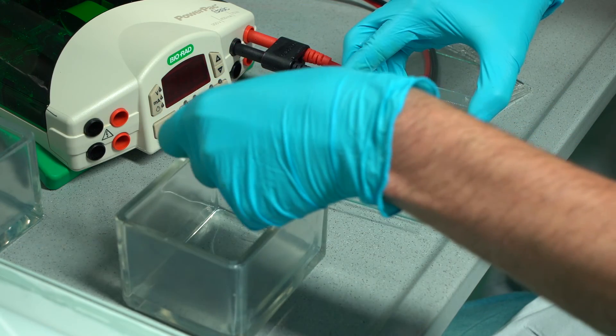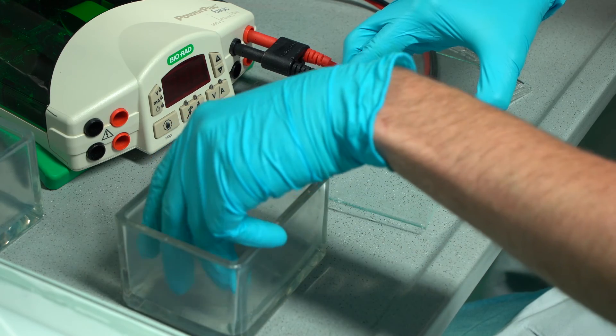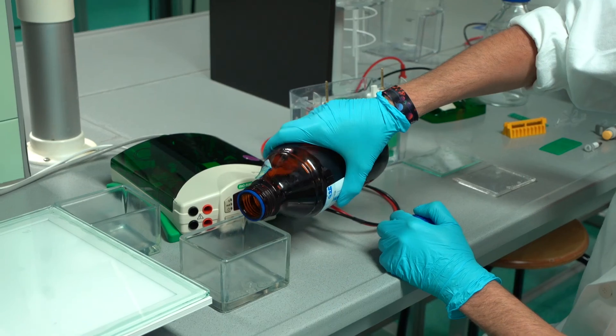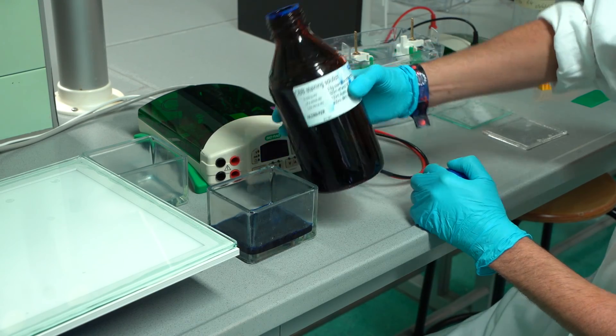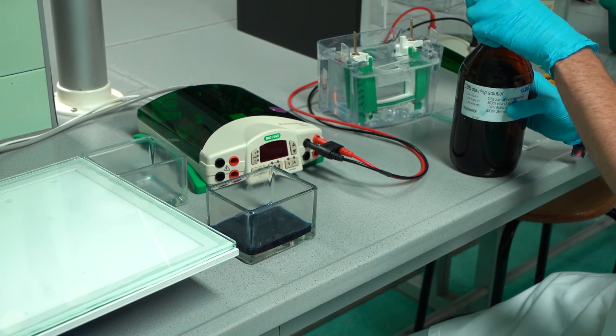Place the gel into a container and add CBB staining solution until the gel has completely been covered. Stain the gel for at least half an hour. Make sure that the gel does not float to the surface during staining.